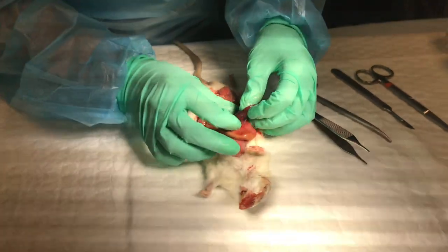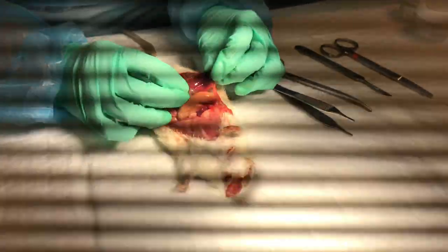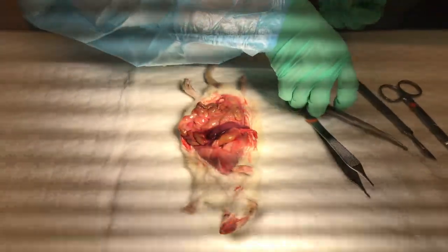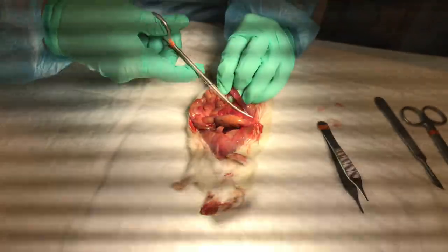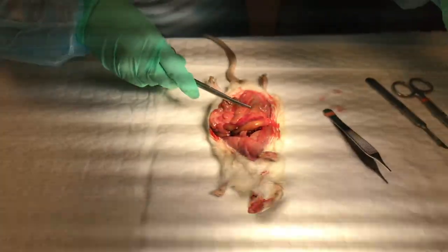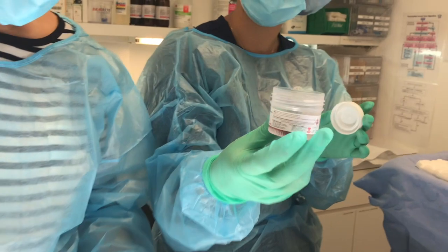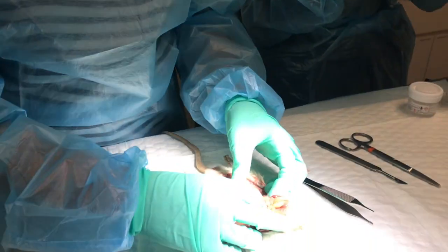This is the spleen here, attached to the stomach. The spleen looks really normal. Maybe a little bit congested, but no discoloration at all. So we can take a sample of the spleen, which really means just submitting the whole spleen. Larger jar, or is this one? Yeah, that's probably good. We have our formalin jars. Will you show this, please, Anna? Thank you. Of our spleen.